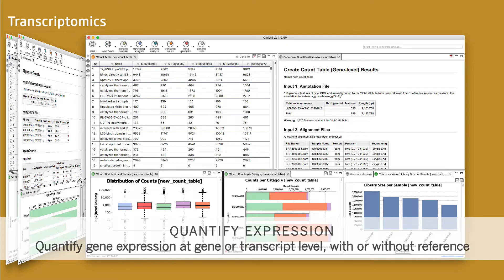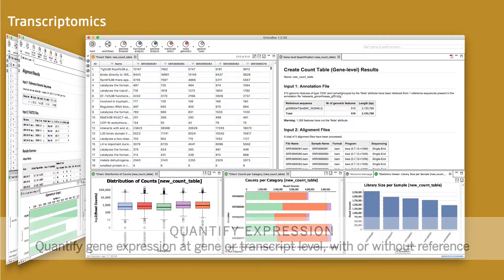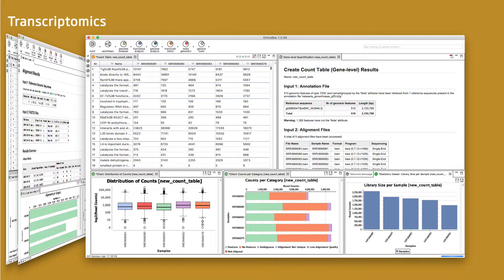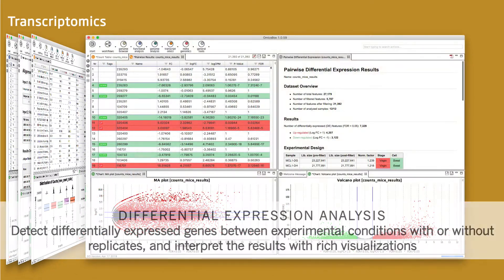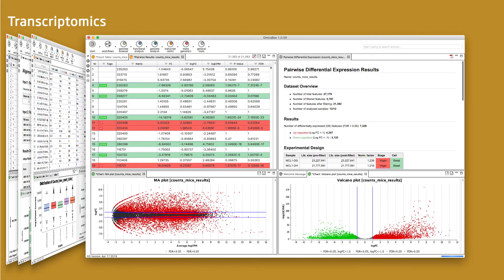The reports include library size plots and counts distributions. The differential expression analysis can be used for pairwise as well as time series datasets and offers rich visualizations.